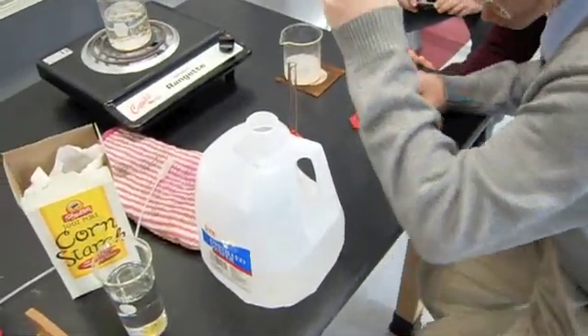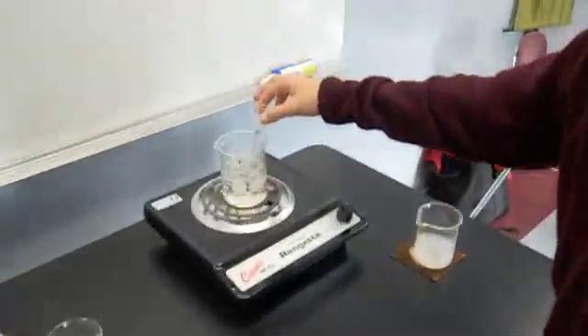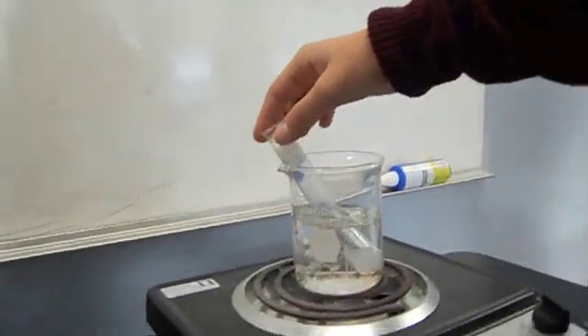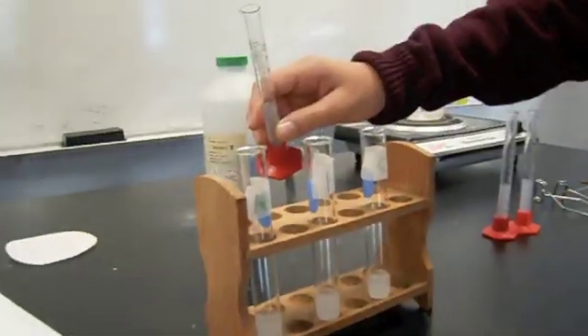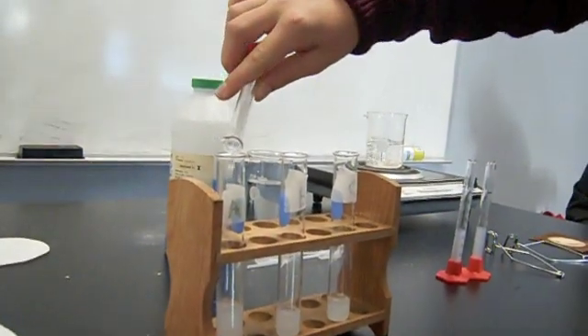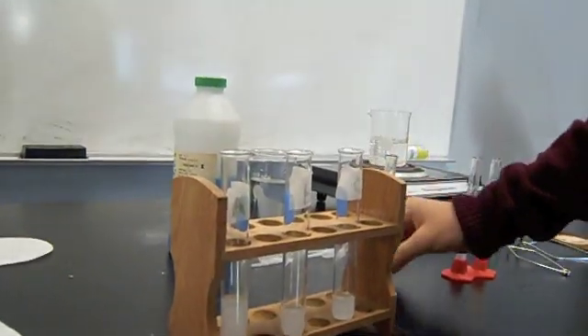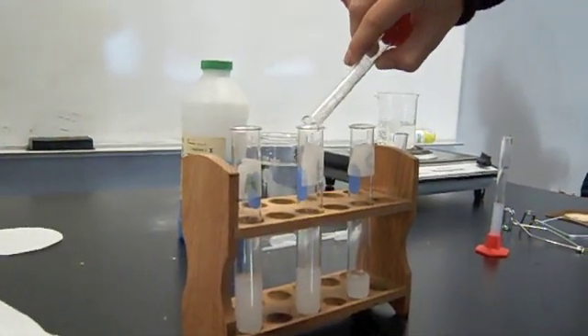Place tube B into the boiling water bath for five minutes. After the five minutes, remove from the bath and place back into the test tube rack. Add five milliliters of starch solution to each tube and thump it to mix. Allow the tubes to sit for ten minutes, occasionally thumping the tubes to mix.